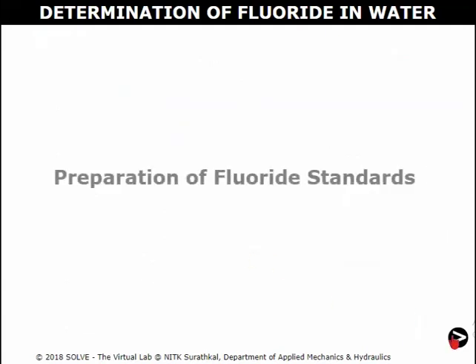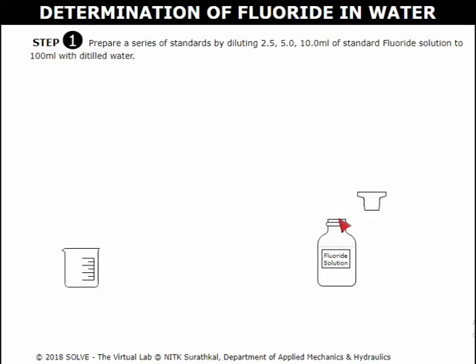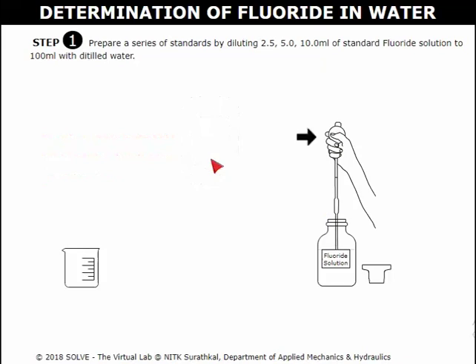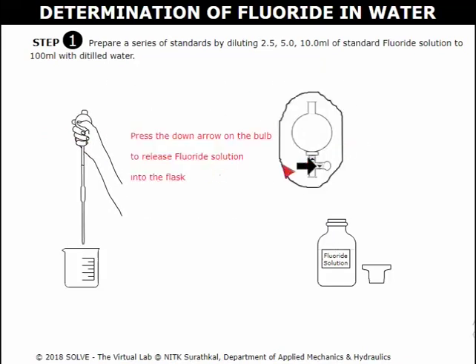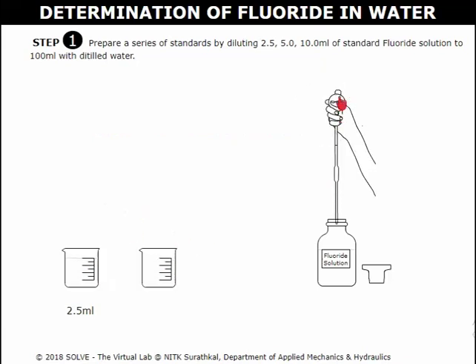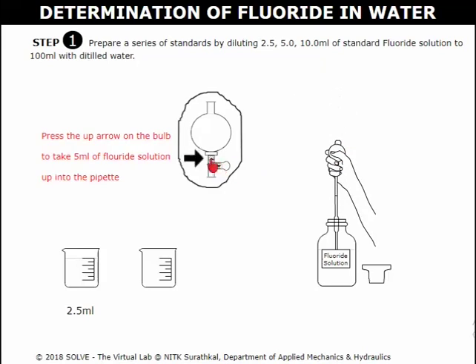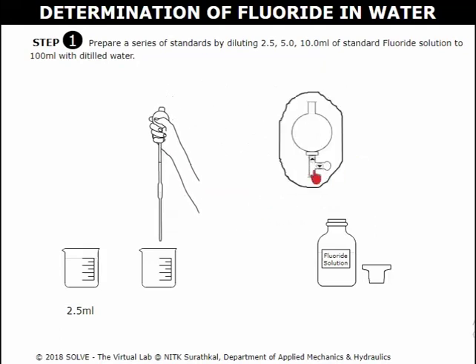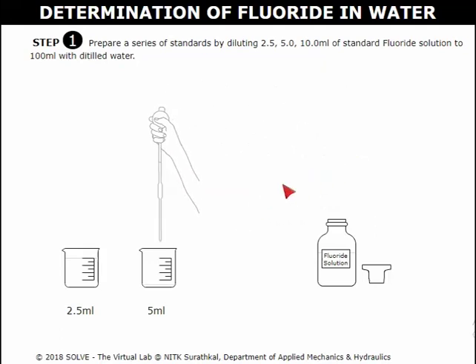Preparation of fluoride standards. Click here to open the bottle of fluoride solution. Click on the pipette to place it in the fluoride solution. Click on the upward pointing arrow to pipette the solution. Click on the downward pointing arrow to release the solution into the beaker. Dilute the solution by adding distilled water up to the 100 ml mark. Pipette 5 ml of solution and add it into another beaker, then add the distilled water.